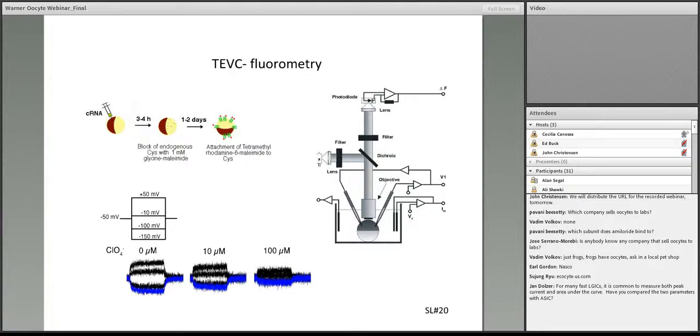Usually, such a positive result is followed by placing the cysteine in several neighboring positions to build up a hypothesis about the conformational changes of the region of the protein.